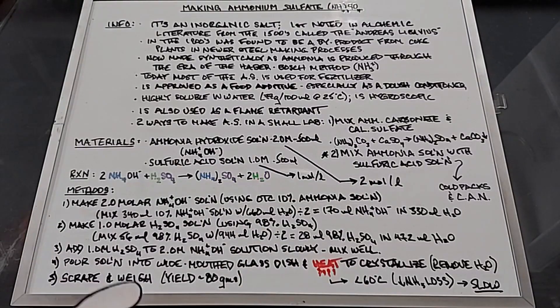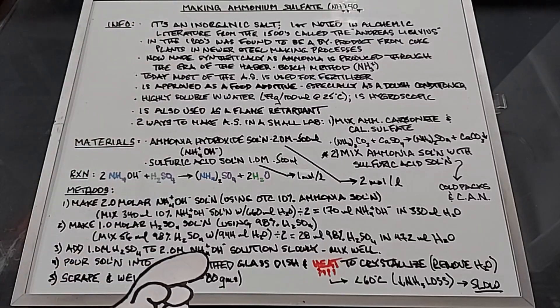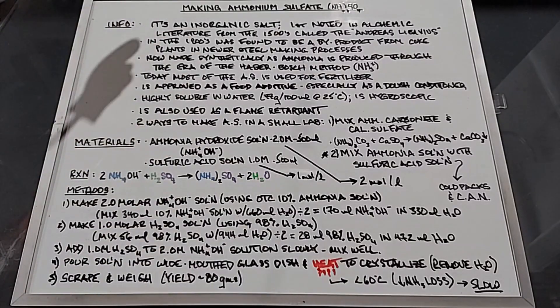Okay, we've got crystallization. I want to scrape it out good and weigh it. The yield should be around 80 grams of ammonium sulfate. Let's go make some ammonium sulfate.